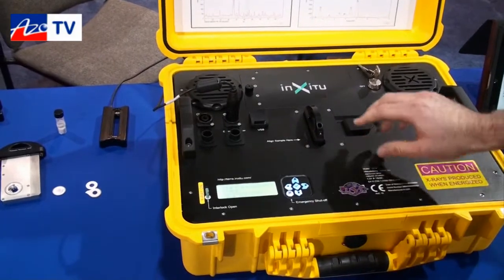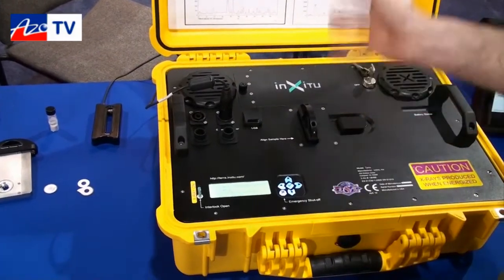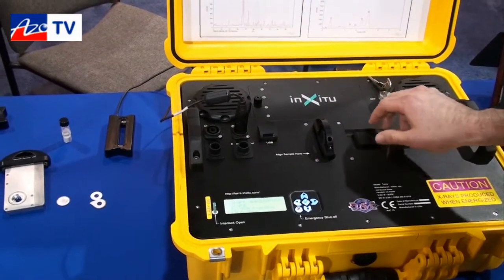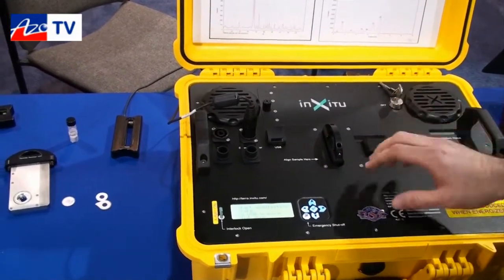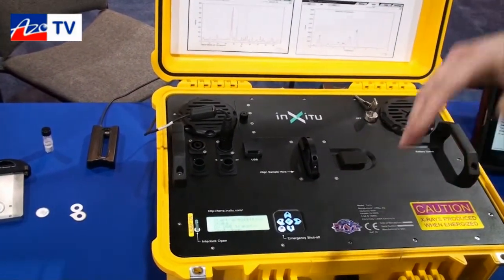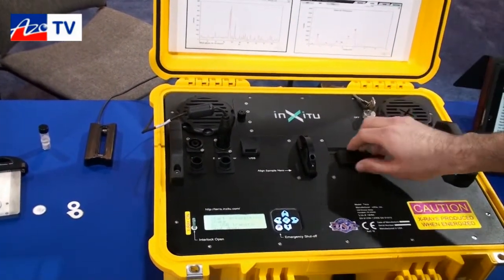The instrument is really easy to use. Everything is stationary, so you can actually move it around and it can go into rugged environments. We have an x-ray tube and a two-dimensional detector, and that allows us to get very quick diffraction patterns that somebody could take in the field and then download to a PC and analyze.